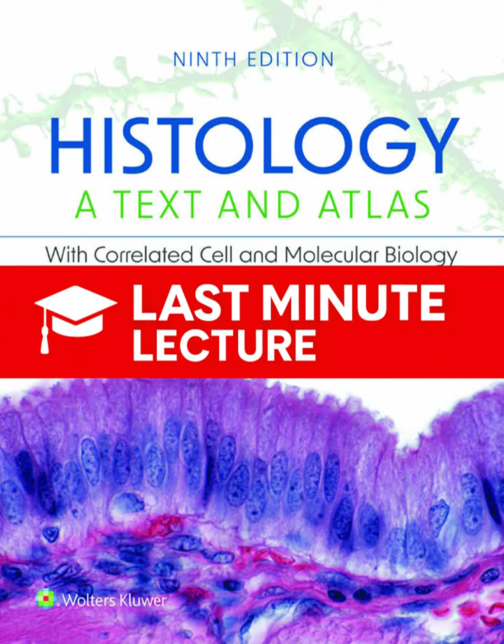We should start right at step one, getting the tissue specimen ready in the first place. So the process really begins with the end goal in mind, which is creating that routinely prepared hematoxylin and eosin, or H&E, stained section. That's the gold standard, right? The one that's studied pretty much everywhere. It is. But you can't just take a piece of raw tissue and slice it. The first, and maybe the most crucial step, is fixation.